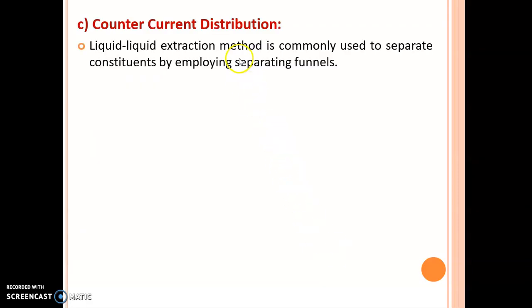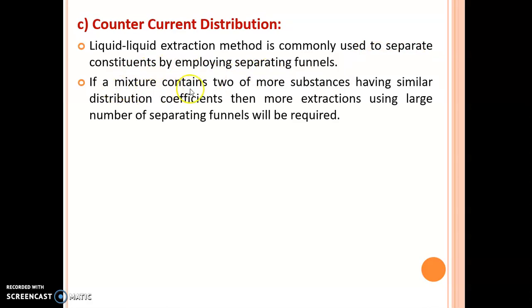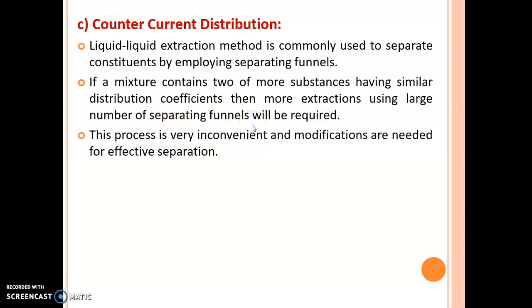Okay. Now it is also divided into third type, that is counter current distribution. So liquid-liquid extraction method is commonly used to separate constituents by employing separating funnels. If a mixture contains two or more substances having similar distribution coefficients, then more extractions using a large number of separating funnels will be required.